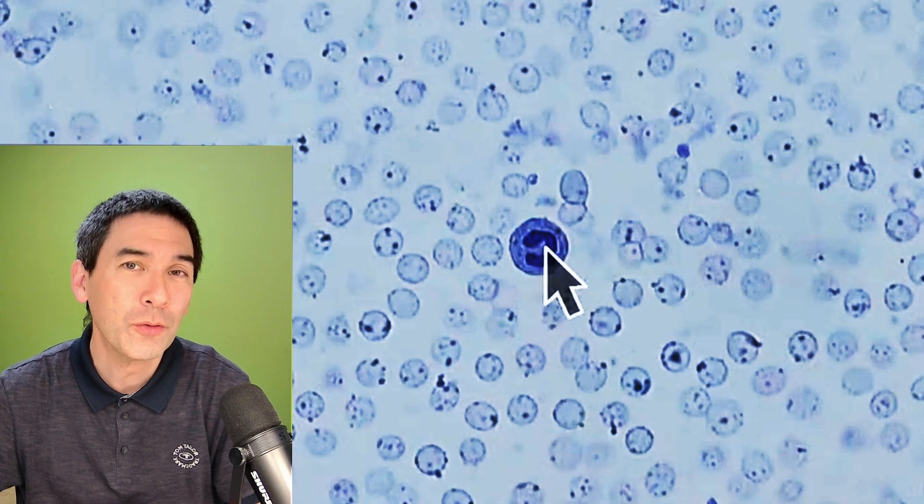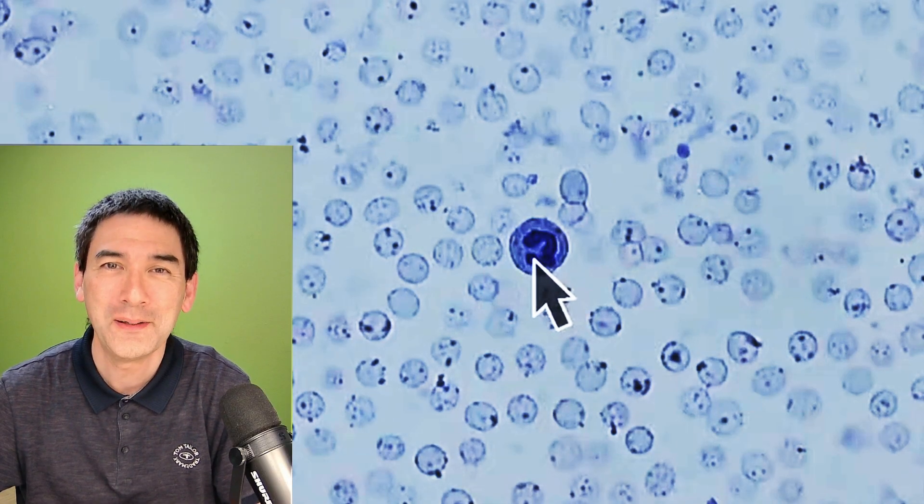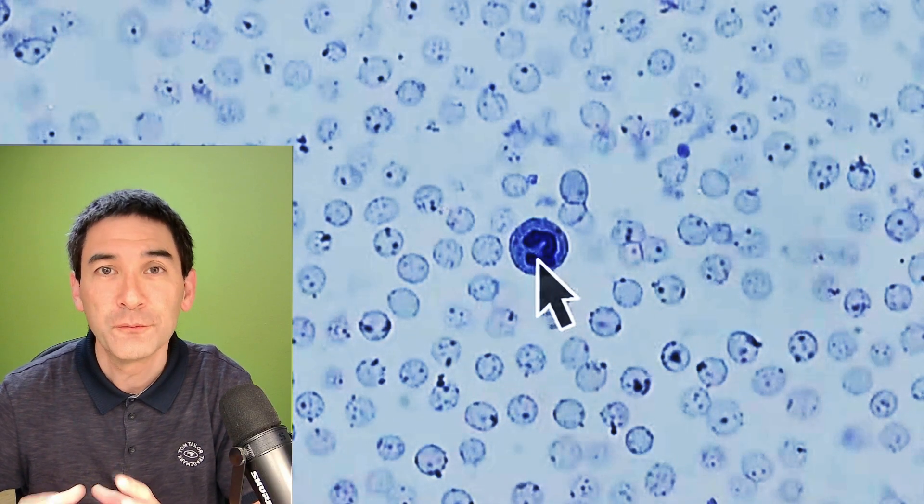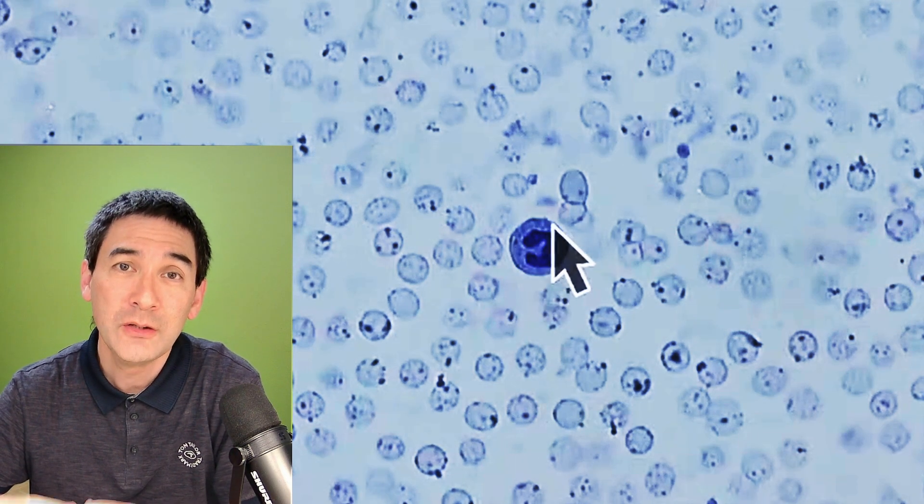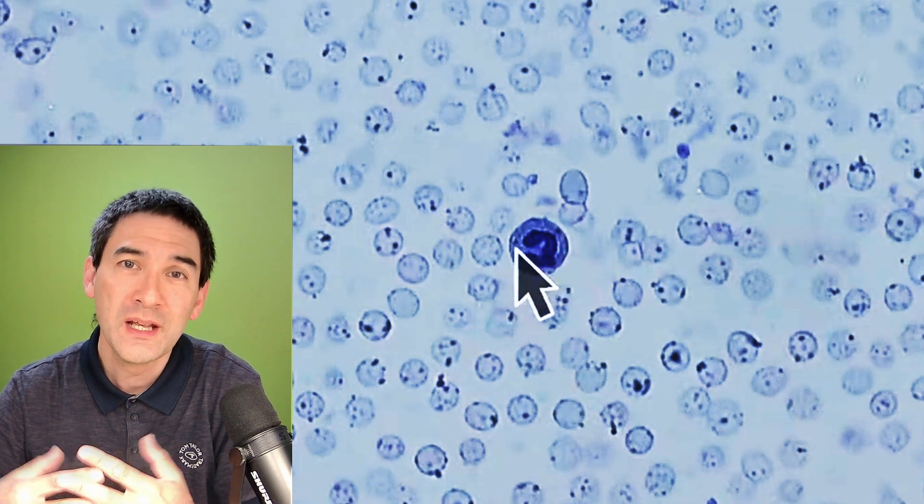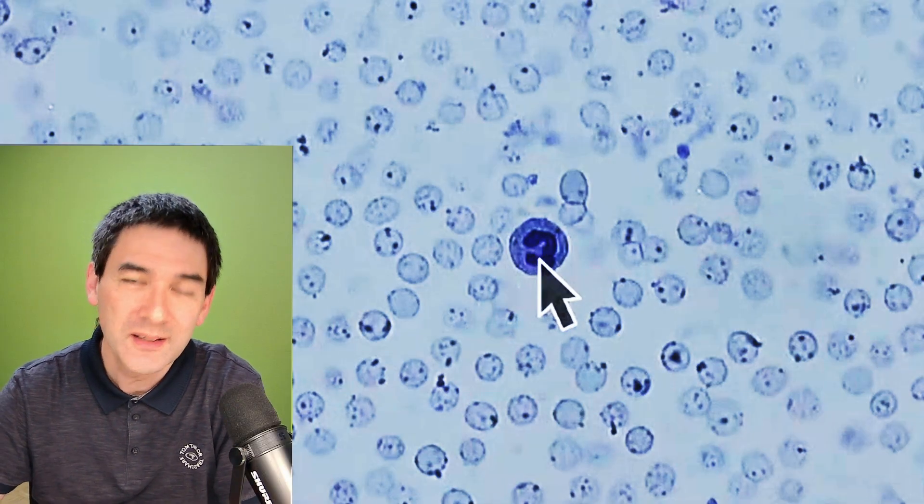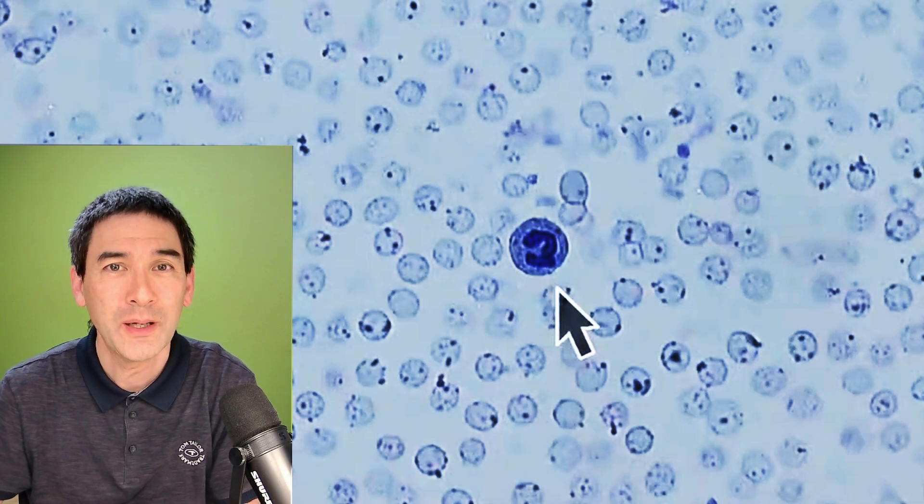You call this polymorph nucleated. I love these complex terms. Polymorph means different types of shapes and it's very typical for some white blood cells to have a nucleus that has these lobes and depending on the shape of the nucleus again you're able to categorize the white blood cells.